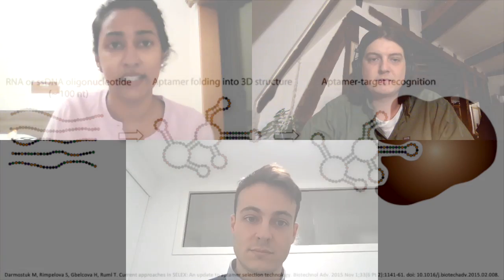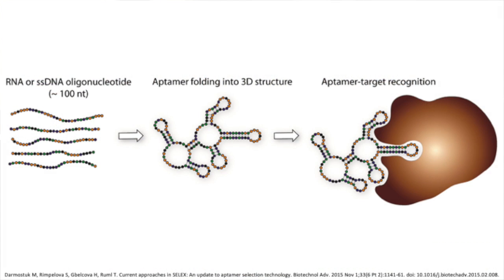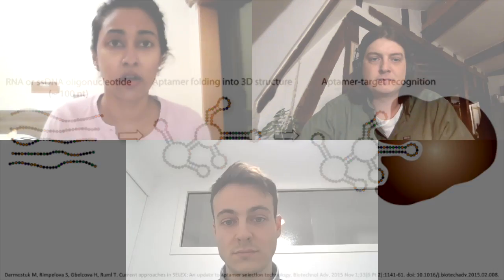So what is the bioreceptor that I'm using? It's a piece of DNA sequence. I guess everyone knows what DNA is, but it's possible that just a piece of DNA sequence can sometimes have affinity for a specific protein. I use a process from which there is a group of millions of these sequences called aptamers. And I used a process called SELEX, which stands for systematic evolution of ligands by exponential enrichment.